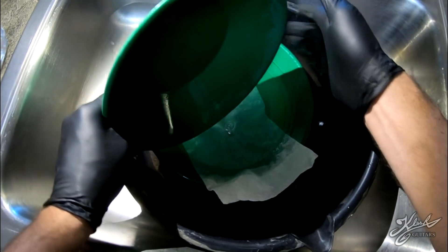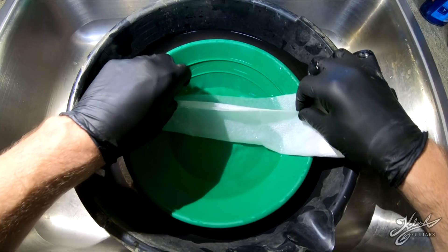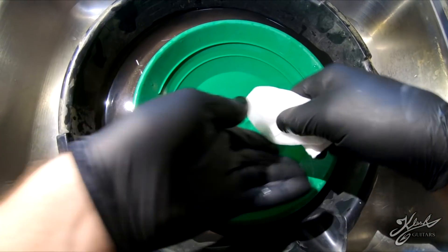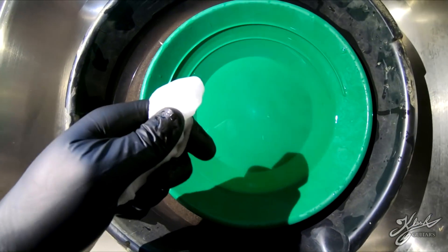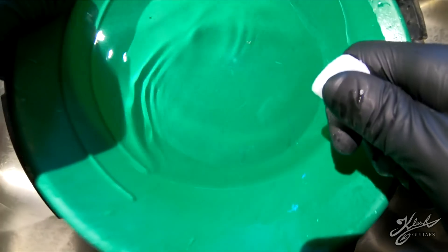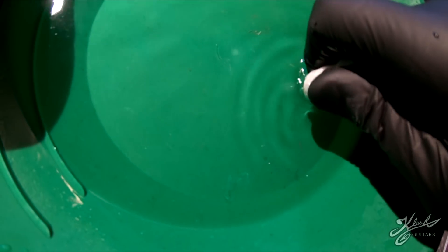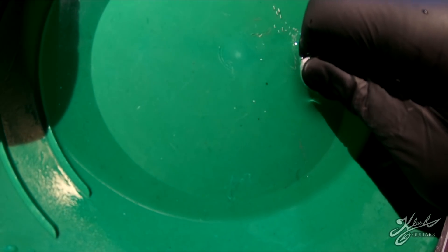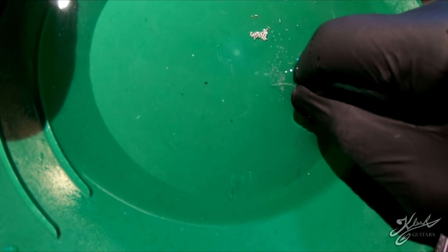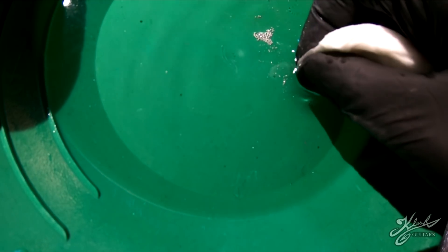We'll take a paper towel, dump it on there, make sure we got it all. Now we have all of our mercury here at the bottom and we're just going to squeeze it through. We'll try to do it underwater - we don't want that mercury going anywhere - so I always try to work underwater with it. All right, I think all the liquid mercury is through.